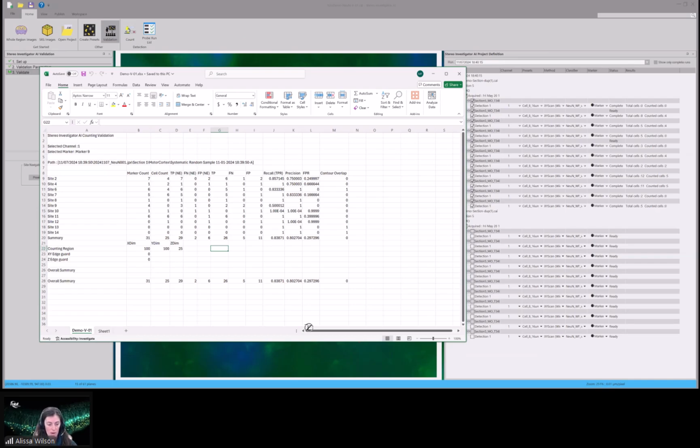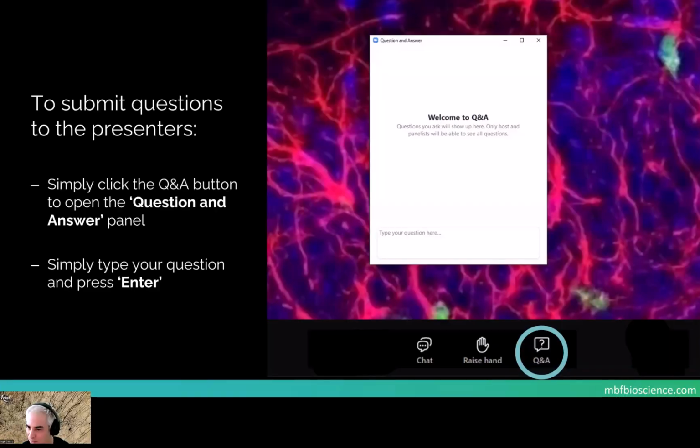and we can begin the question and answer portion of the webinar. So we are receiving some questions here. There's one question about how to make a contour.